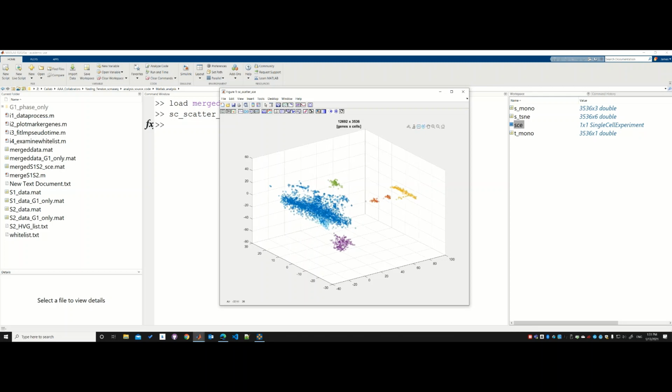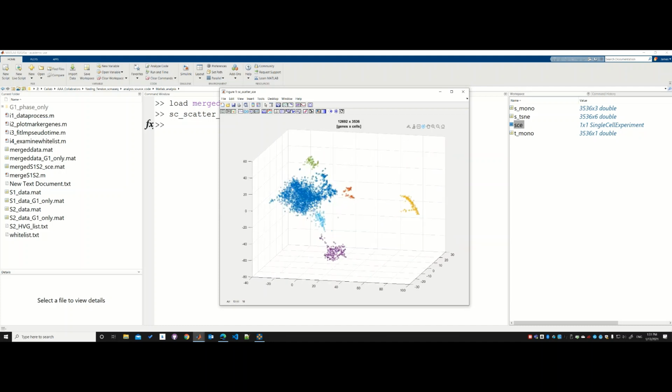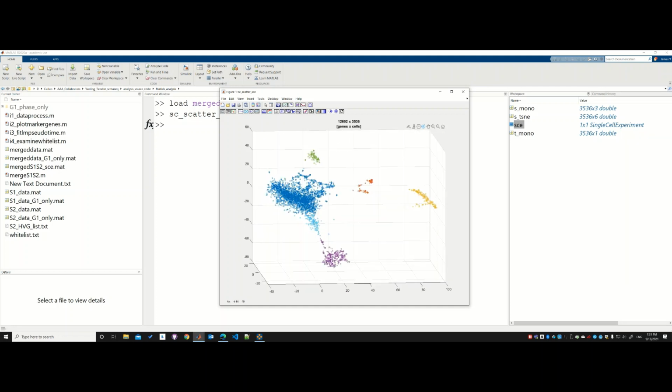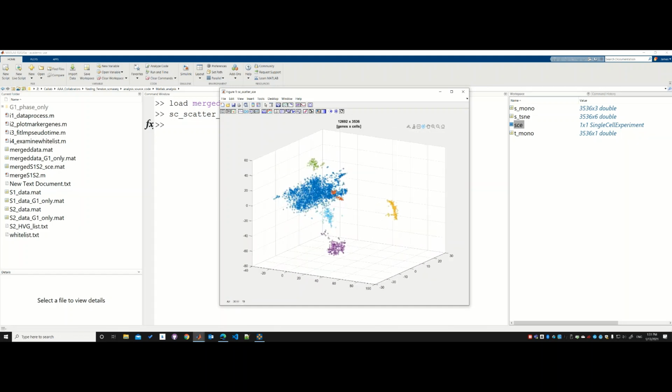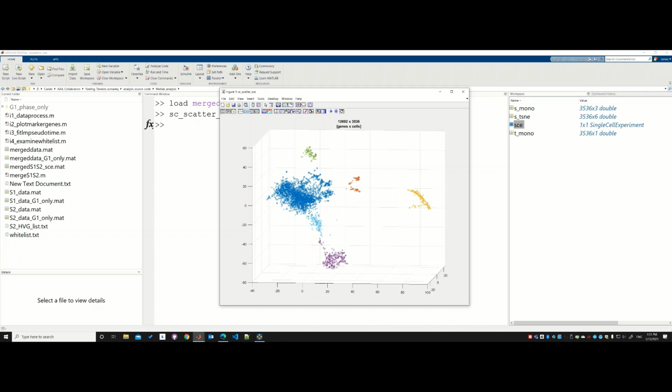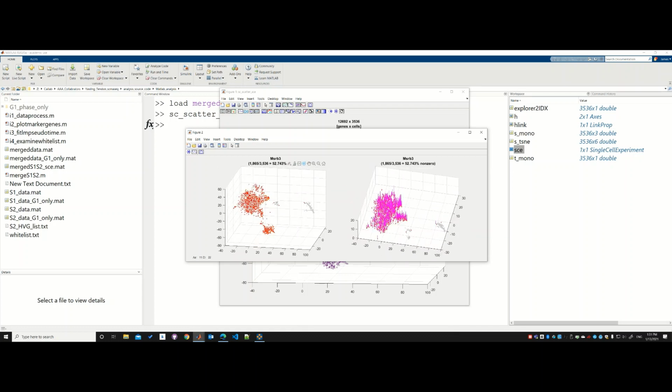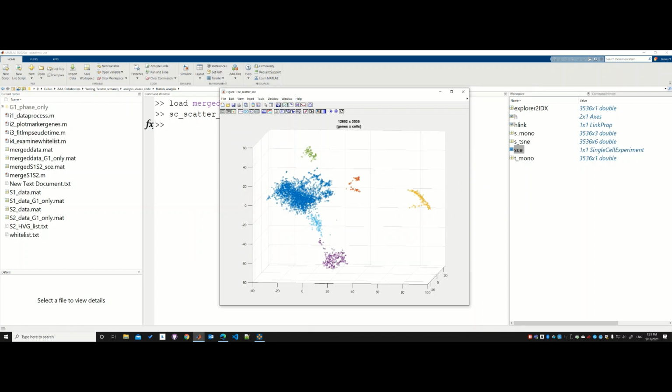So you can do the same as you have already done for the scatter plot for single cell, and you visualize the different clusters. And then, with the first button, you can see the expression of the genes. Select one and see it across all the cell types. Okay, you still can rotate and look at where the gene is expressed. And then with the next button, you will be able to select to highlight the cells by their properties.